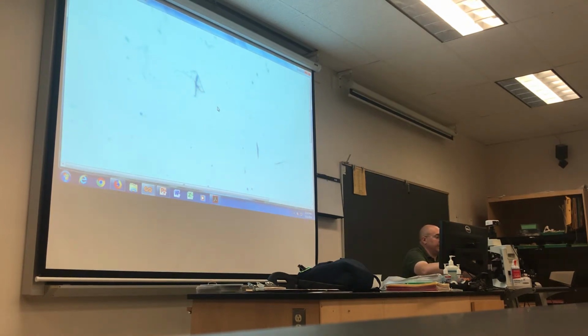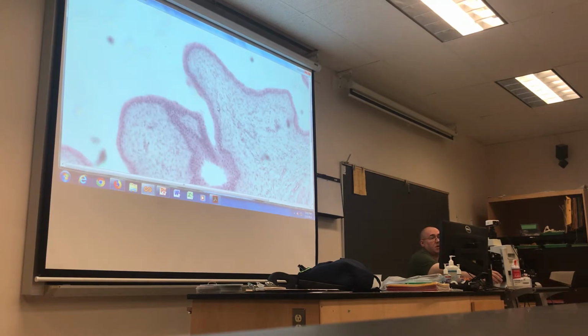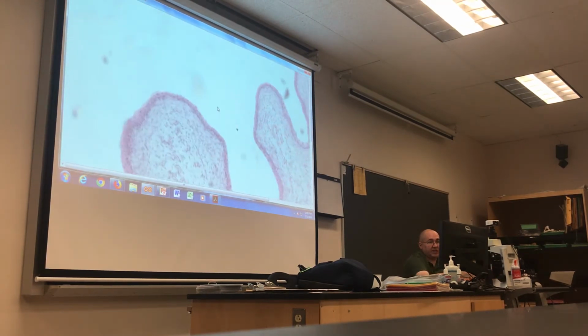Next, we'll look at the bladder. Kind of go through here, check that stuff out. So here's the lumen, right? Here's where the urine would be passing by, right? Kind of up in this area here, when it's hanging out in the bladder there.